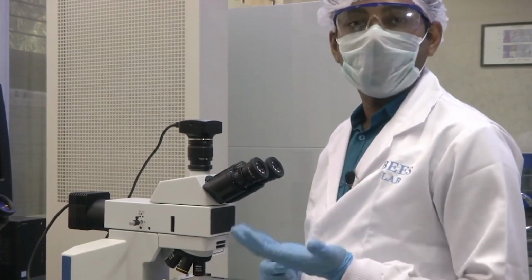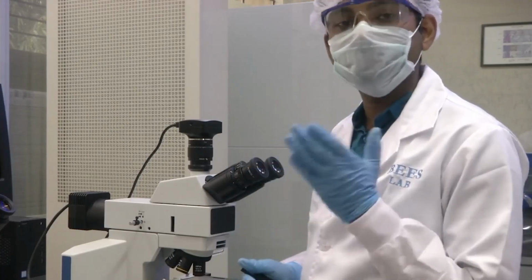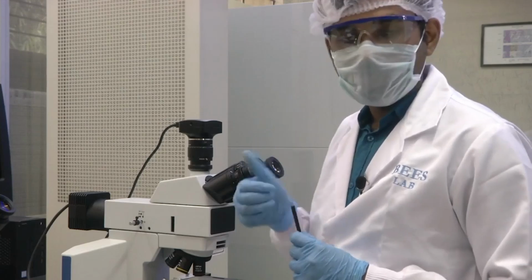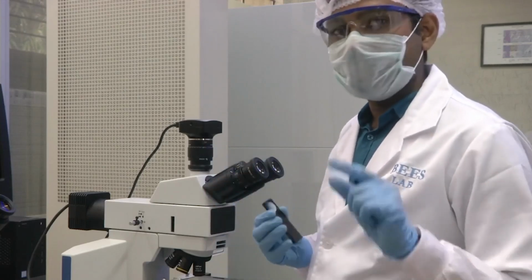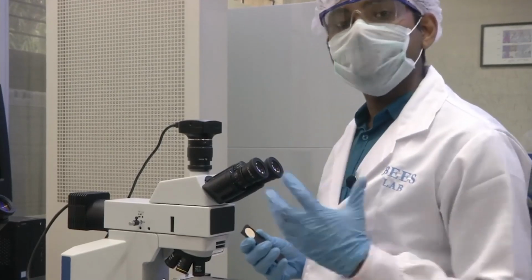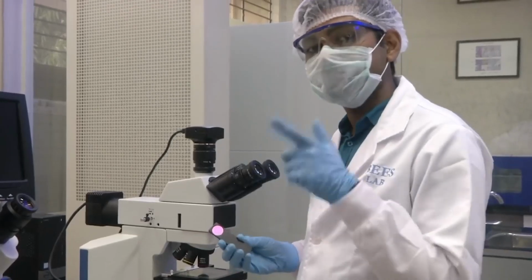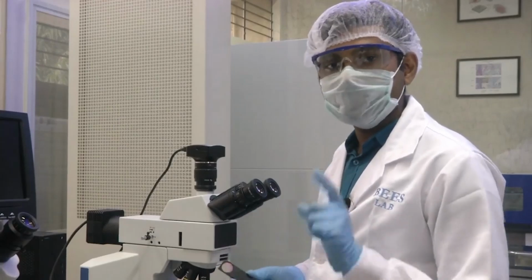If you know Planck's law, the wavelength energy relation is h nu, where nu is the frequency, or h nu is also equal to h c by lambda. So as lambda goes up, your energy comes down. Similarly, as lambda goes down, your energy goes up. Blue light has low lambda, less than 480 nanometer. So blue light has higher energy. Yellow light has higher wavelength, so it has lower energy. Remember, h c by lambda. H is Planck's constant, c is speed of light, lambda is the wavelength of the light.